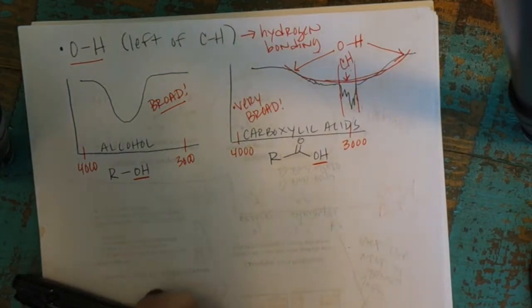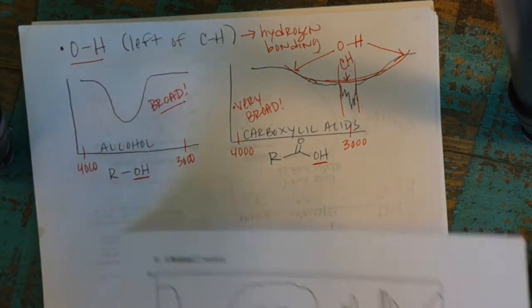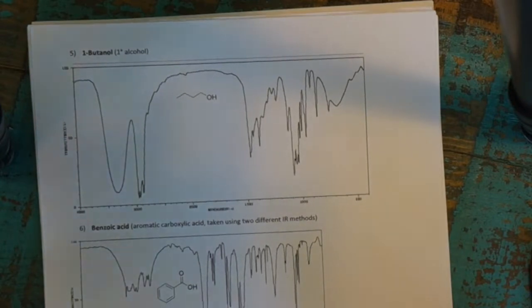Okay, but if you have a carbonyl, you should be looking for this as well. So you should be on the lookout, and we'll talk about that when we're comparing different spectra at the end. Okay, so just to show you some real examples of this.